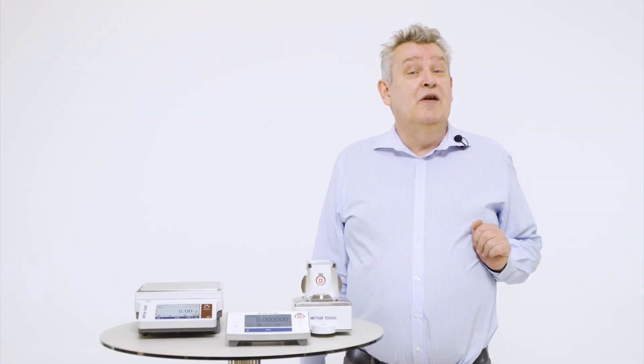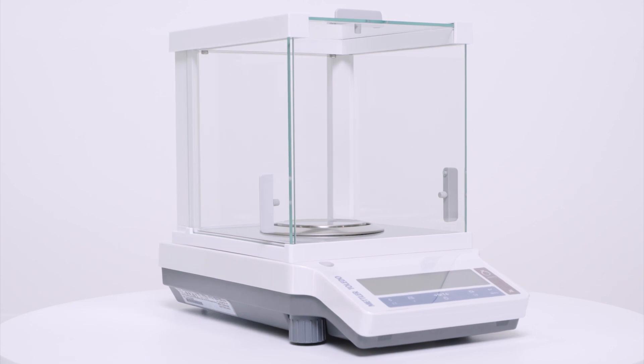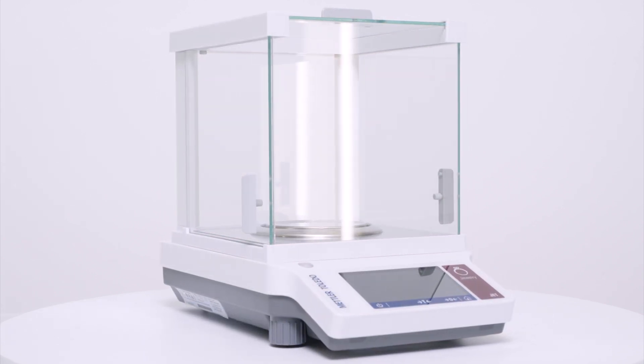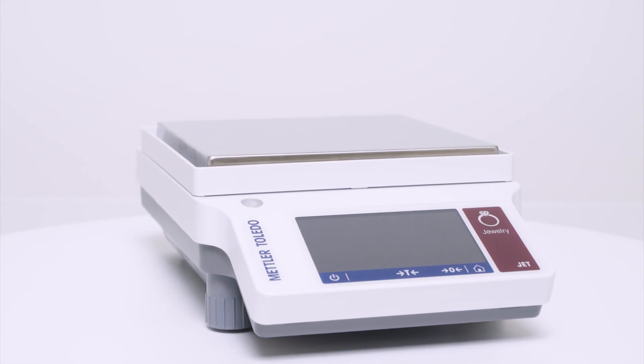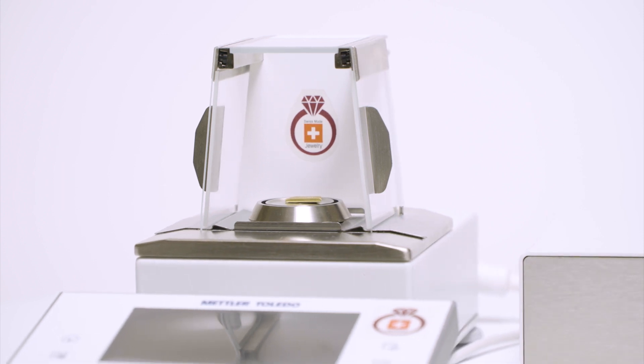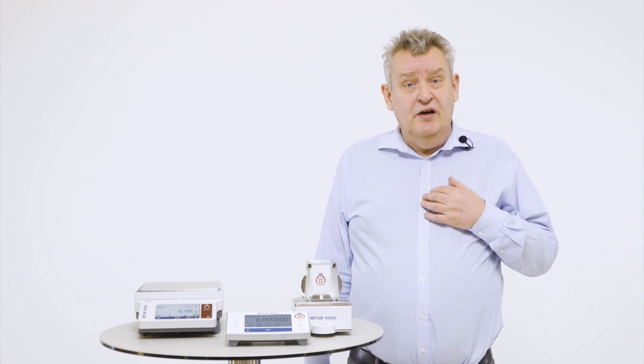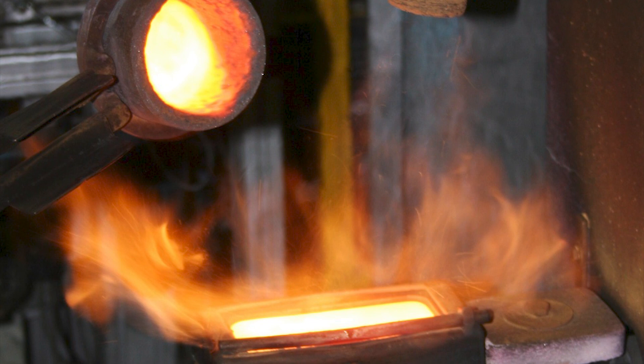Fortunately, hundreds of satisfied customers are using our jewellery balances for a wide variety of weighing applications both in retail and manufacturing, and hundreds of our customers are already assessing their gold purity using Mettler Toledo equipment. Mettler Toledo is a B2B Swiss precision measurement equipment manufacturer, and we offer products designed specifically for the gold fire assay application to ease the gold purity testing process and ensure compliance with gold hallmarking laws.